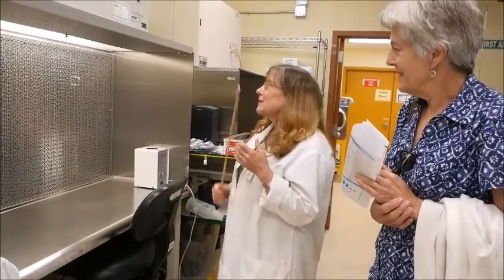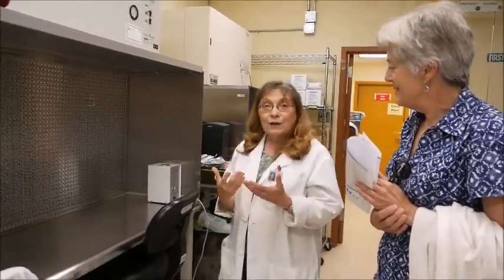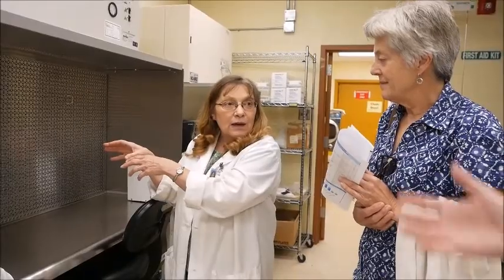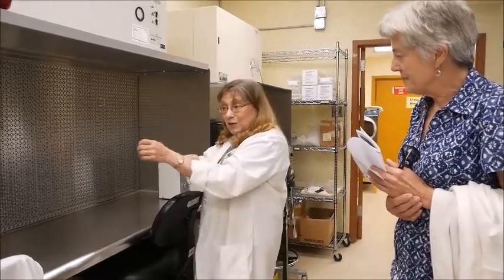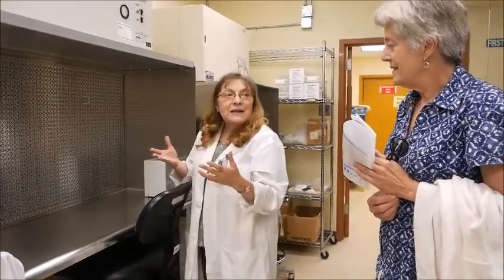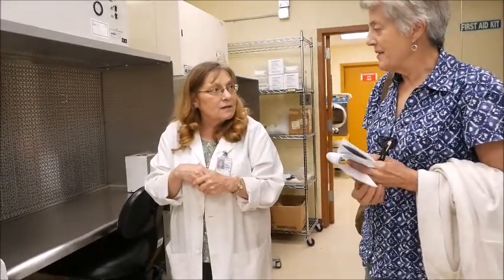So this becomes our sterile workplace — it's not like a cane or glass enclosure. If you were working with a very dangerous human-pathogenic disease agent, you would have a different kind of cabinet. I'm only worried about not contaminating the cultures I work with. If you were working with viruses, you would be fully clothed up, you'd have a glass cabinet in front, an air capture system, and maybe the arms sticking through. Depending on the level you need to work at, you'd have different style cabinets. We don't need to worry about anything but keeping our cultures sterile.